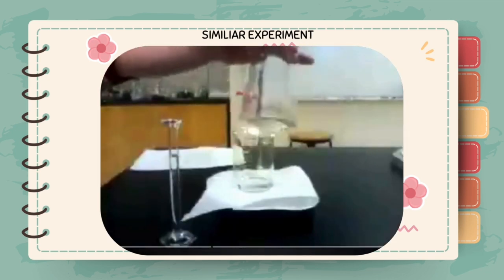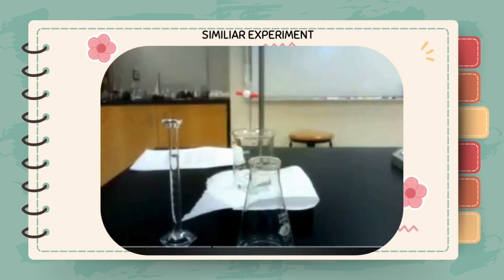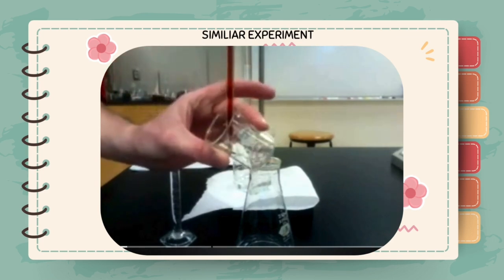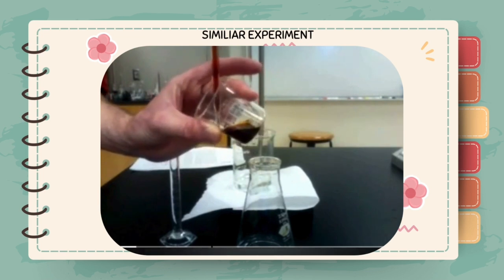A pair of redox reactions. To begin, we have aliquoted a known volume of our glucose solution into a flask. To this, we will add reagents for the redox reaction to proceed, and then follow this up with the titration. As you will be timing multiple reactions in this lab, you may wish to prepare each reaction mixture in advance in a small beaker. This way you can add them all at once and simplify your timing.